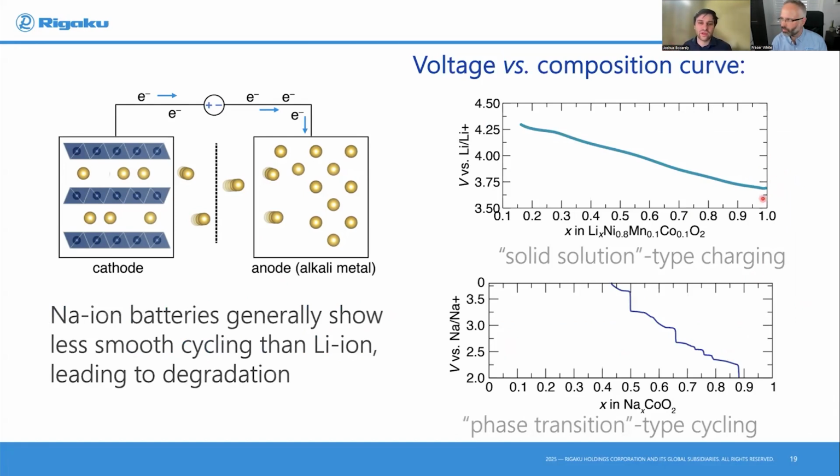If you look at these cycling plots a fair amount, this is a charge-only part, and in this case, the x-axis has switched around. So now we're going from right to left as we charge. You will often see different types of charging profiles. Looking at this NMC, the nickel, manganese, cobalt again, there are some features as it charges, but it's relatively smooth.